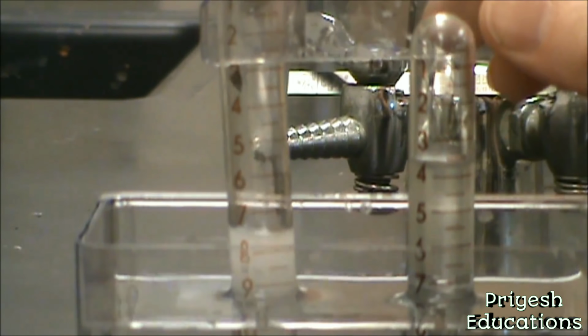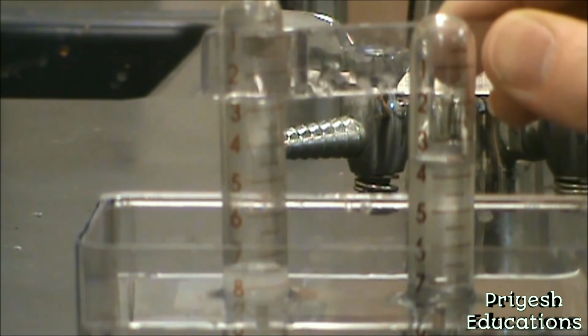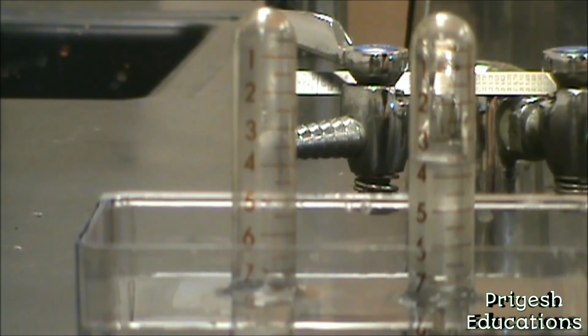And the larger of the two is currently at about 7.6, maybe 7.7. Okay, so 3.8, 7.6, looks like we have twice as much gas on the one side than the other. Let's hook these back up so we can fill them up a little bit more.